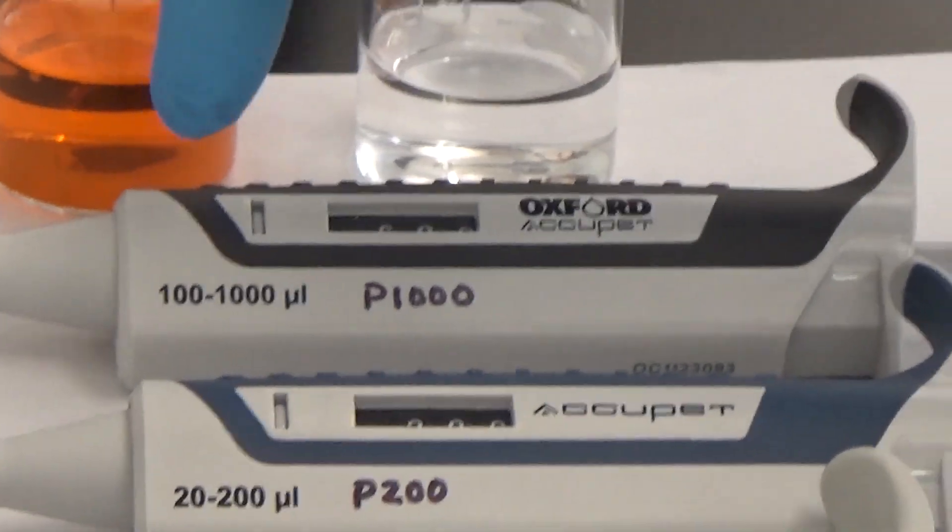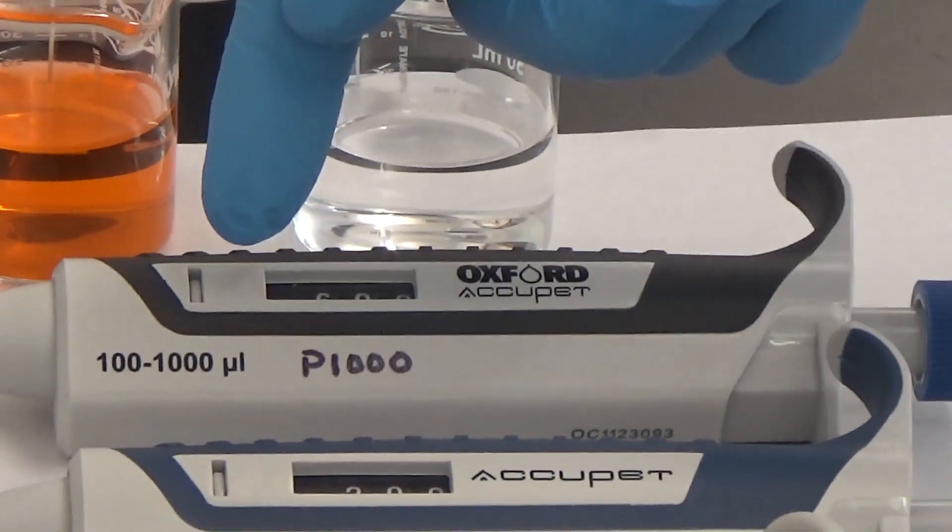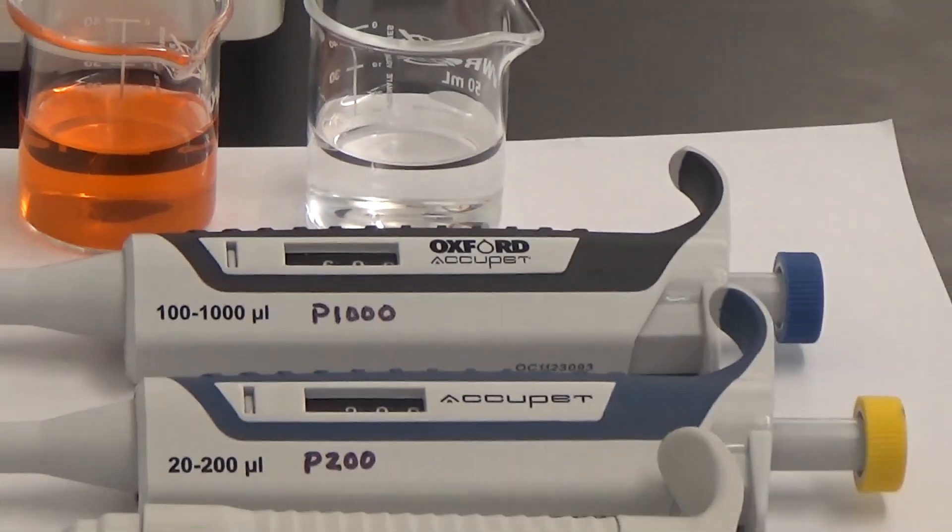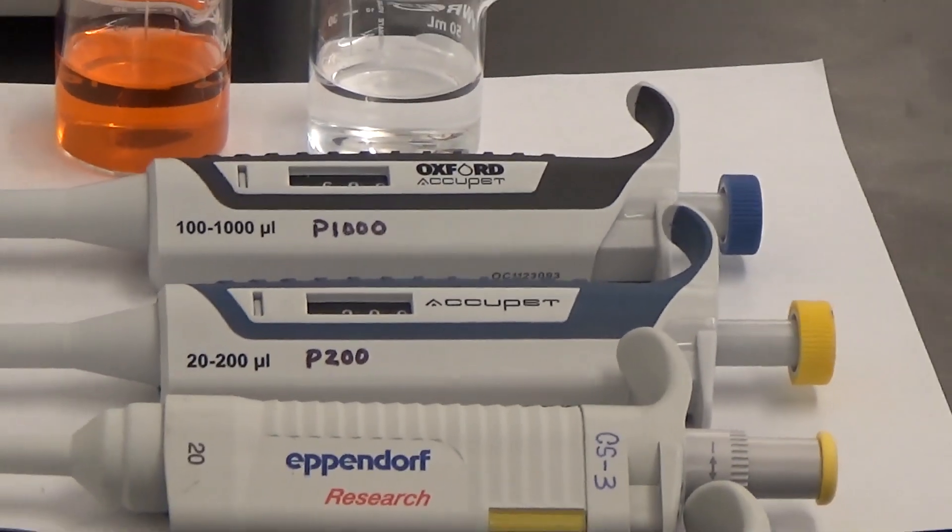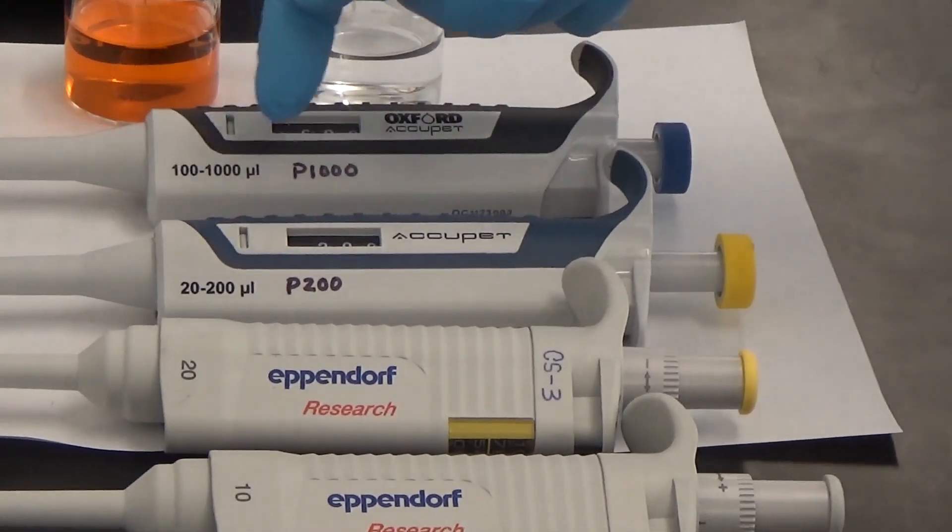This micropipette can measure 100 to 1000 microliters. The maximum volume it can measure is 1000 microliters, so the size of this micropipette is P1000.